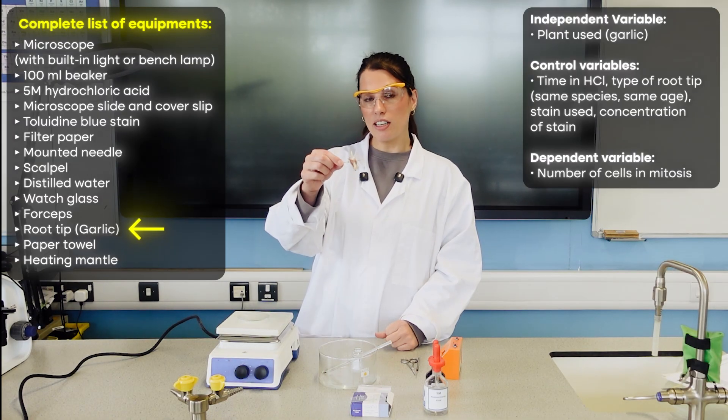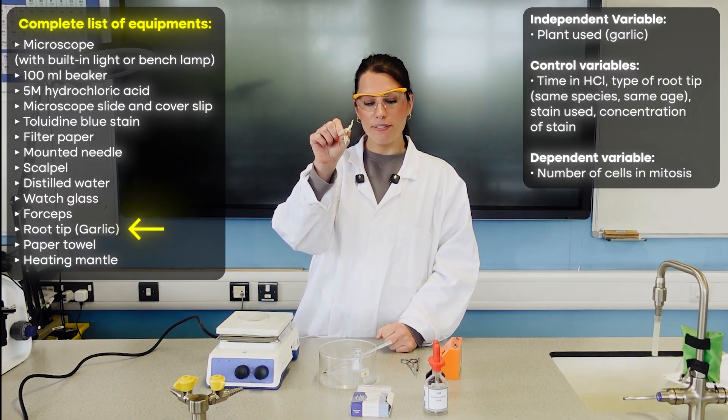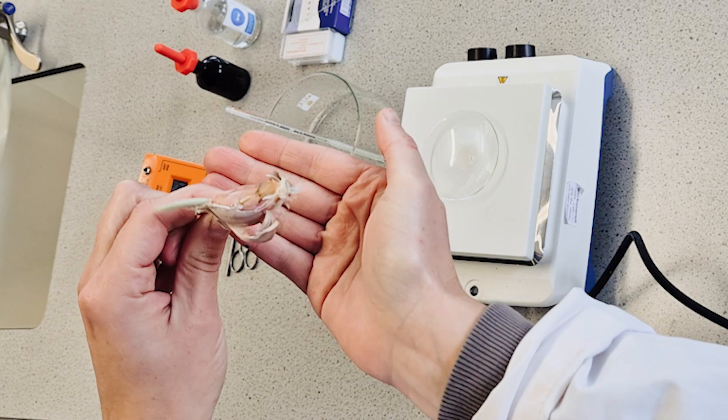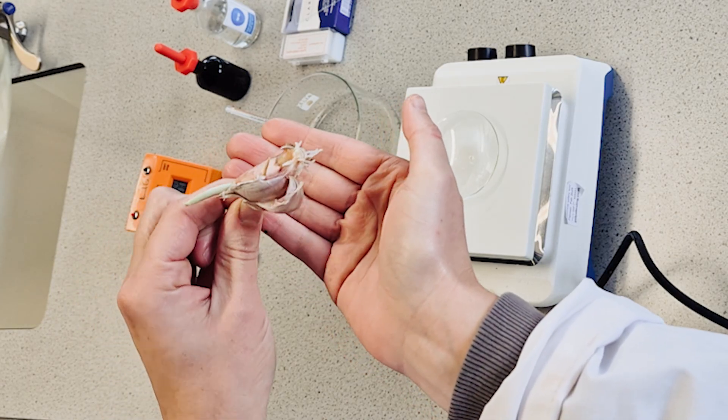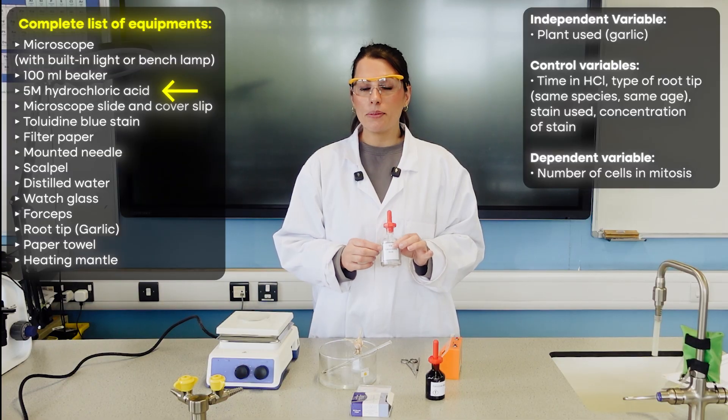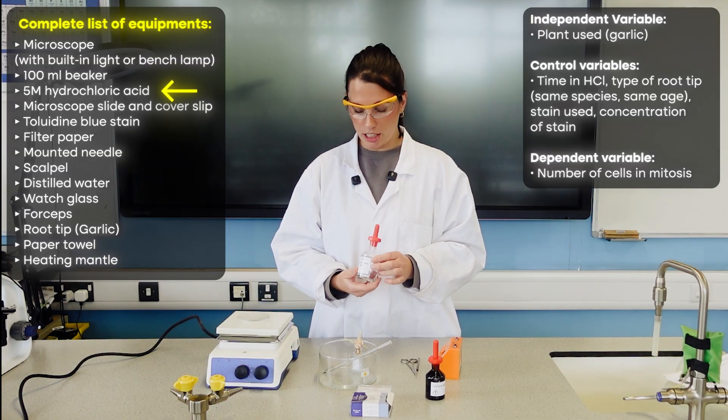You are going to need garlic that has been left to grow submerged in water so you have roots. We need acid, and the role of this acid, which is actually a really common exam question now, is that it's going to stop mitosis happening any further, so we get a snapshot.